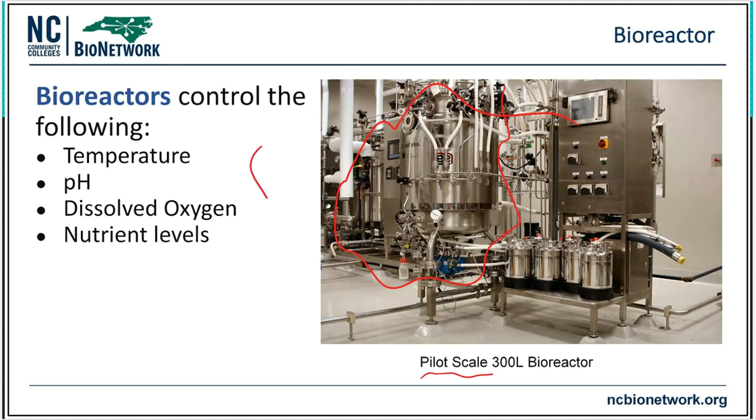What you see on the screen right now are 4 of the most important things that we need to look for, that we need to monitor, that we need to double check. The first one is temperature. Again, we want to make sure Goldilocks, that's what we're after. Not too hot, not too cold, just right. And let baby bear come back home and figure out what's going on.